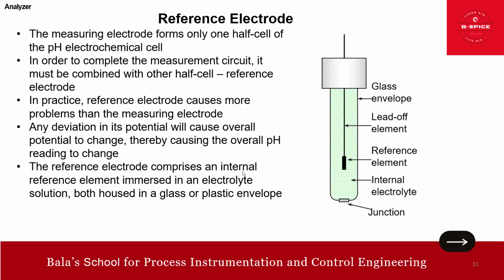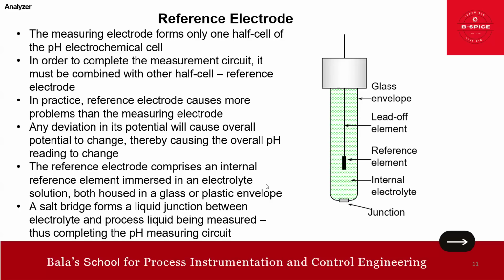So the reference electrode comprises an internal reference element, immersed in the electrolyte solution, both housed in a glass or plastic envelope. A salt bridge forms the liquid junction between the electrolyte and the process liquid being measured, thus completing the pH measurement circuit.